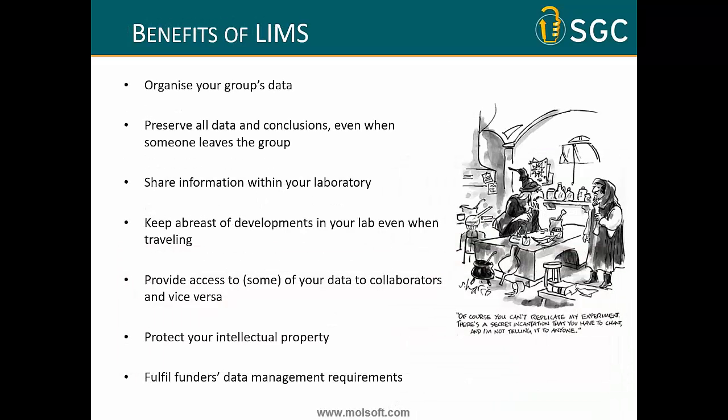So why is LIMS a good idea? And this is the standard slide I show everybody, no matter whether they come from industry or biotech or academia. A lot of this is common sense. It allows you to organize your group's data, preserve that data, especially when someone leaves the group, share that information with your lab, and keep abreast of the developments even when you're traveling. It's also very useful for being able to collaborate as well. Being able to share what's happening in the lab with other people is good.